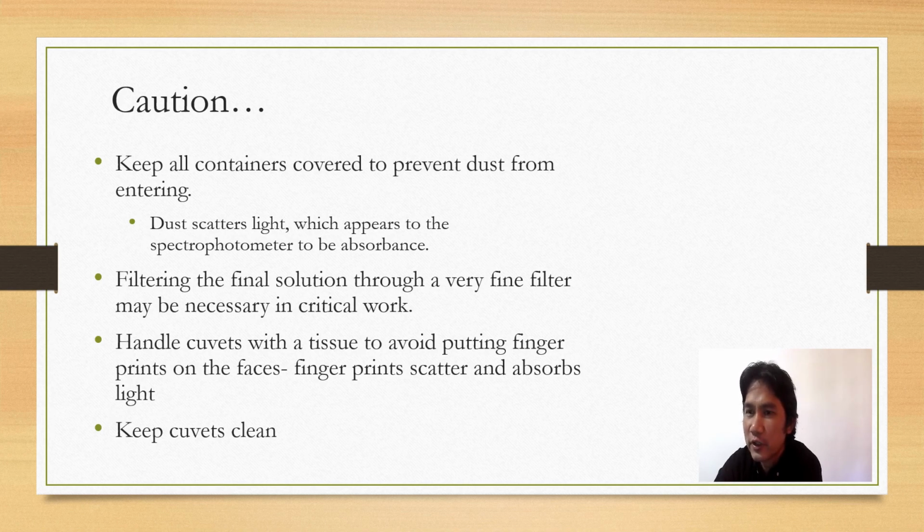So the dust alters the absorbance. So if your solution has undissolved solid, it may be necessary to filter the final solution with a very fine filter. Okay, because even a tiny particle absorbs the light, so it will lead to false reading.